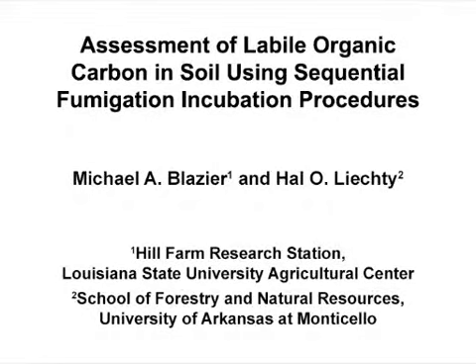The overall goal of this sequential fumigation incubation procedure is to estimate labile carbon and the potential carbon turnover rate in soil. This method can answer key things in the soil microbiology field, such as the amount of substrate that soil microbes use to transform nutrients in the soil. One of the main advantages of this technique is that it's relatively simple to use and inexpensive.